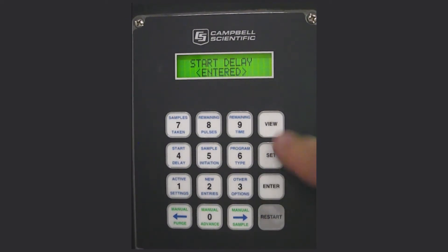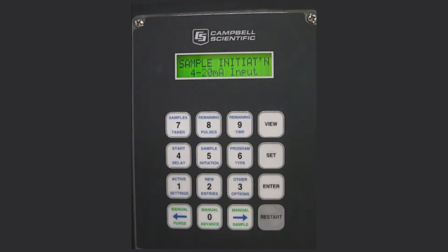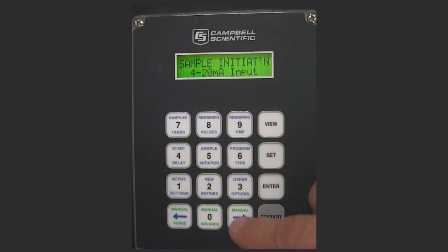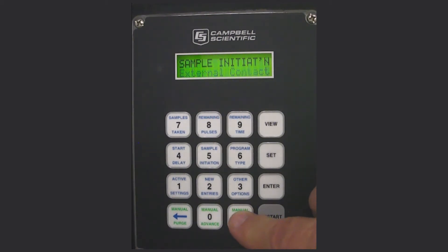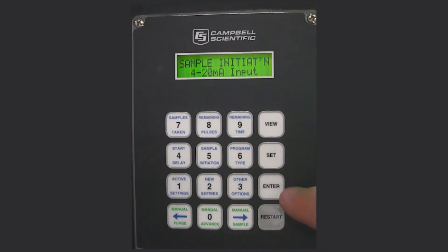Now press enter and then press SET number 5 for sample initiation. In this case we want it to be a 4 to 20 milliamp input. Using the left or right arrow keys you'll see the same options: external contact, disabled, interval time which is new, pulse input, and 4 to 20 — which is where we're going to be.